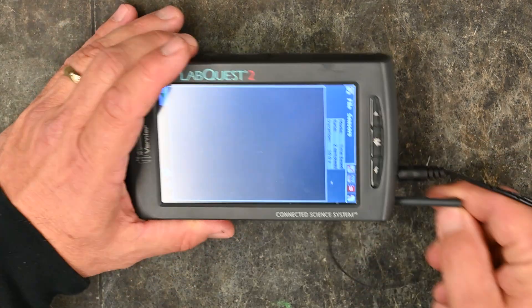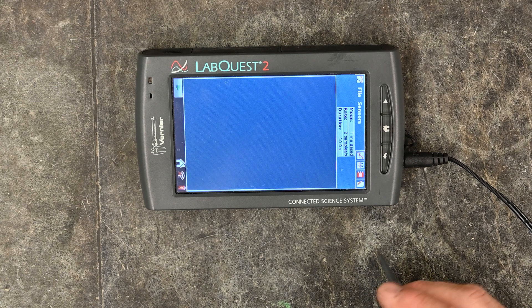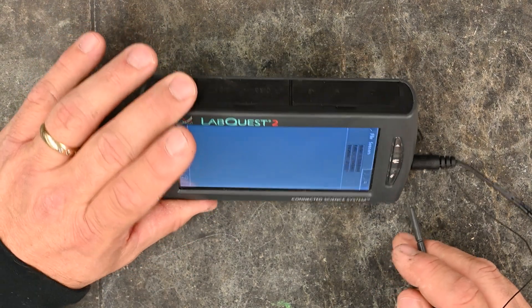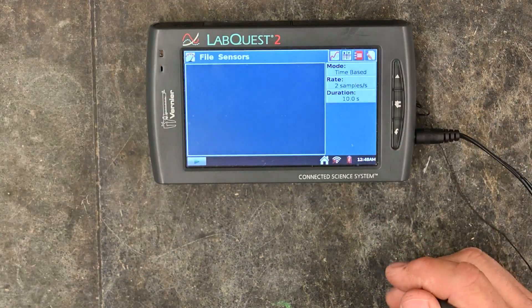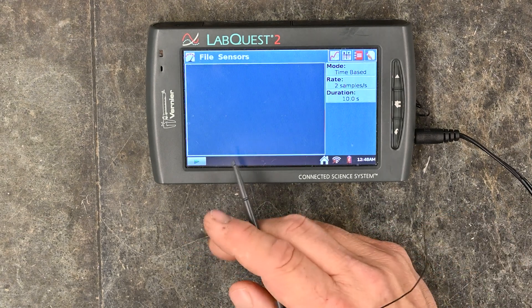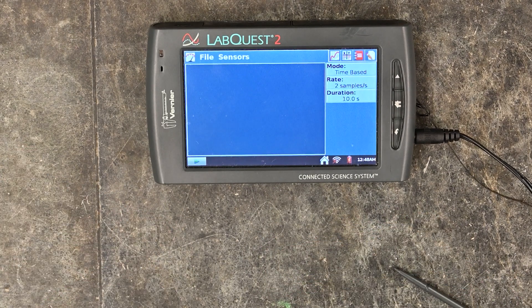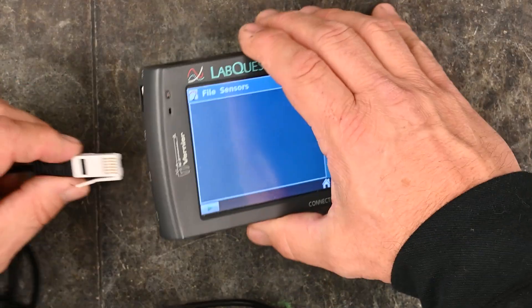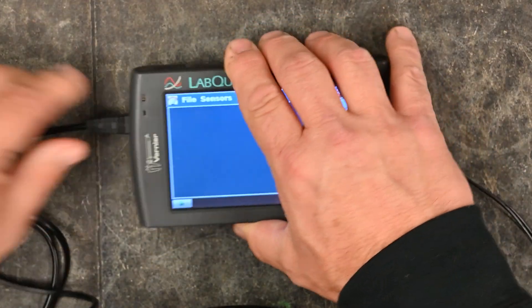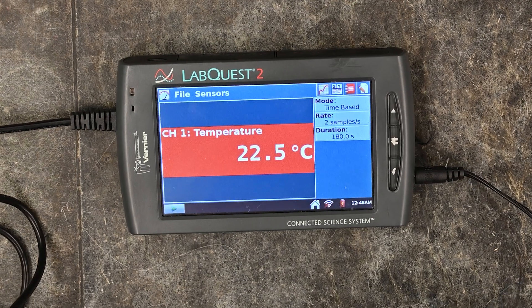Once you have this plugged in, it will rotate the screen. The first view that comes up is for sensors, and once you plug a sensor in you will actually see it right away. We're going to plug in a temperature sensor and right away you see the temperature comes up — it's already ready to go.